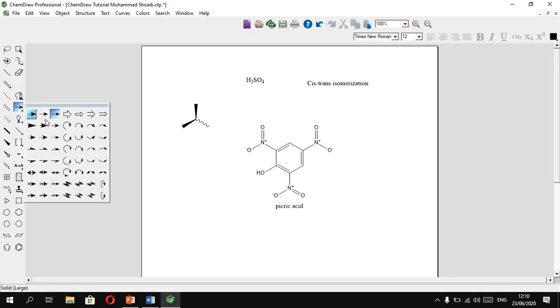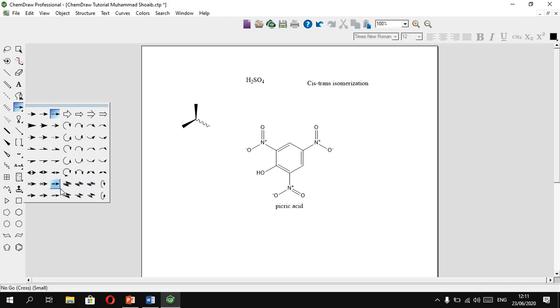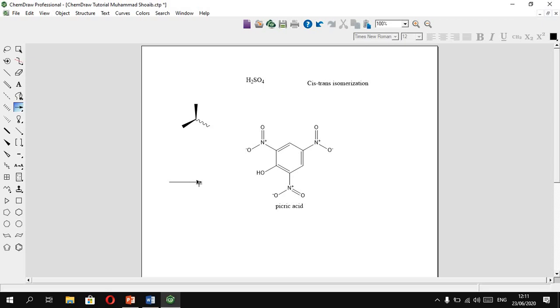Here are different types of arrows. Single-headed arrows on one side show reactants to products. These are mechanism arrows — fishhook or electron curved arrows which show the transfer of one electron. There are also single-headed arrows, equilibrium arrows, broken arrows which show no reaction, and resonance arrows. We can select and draw any arrow we need.